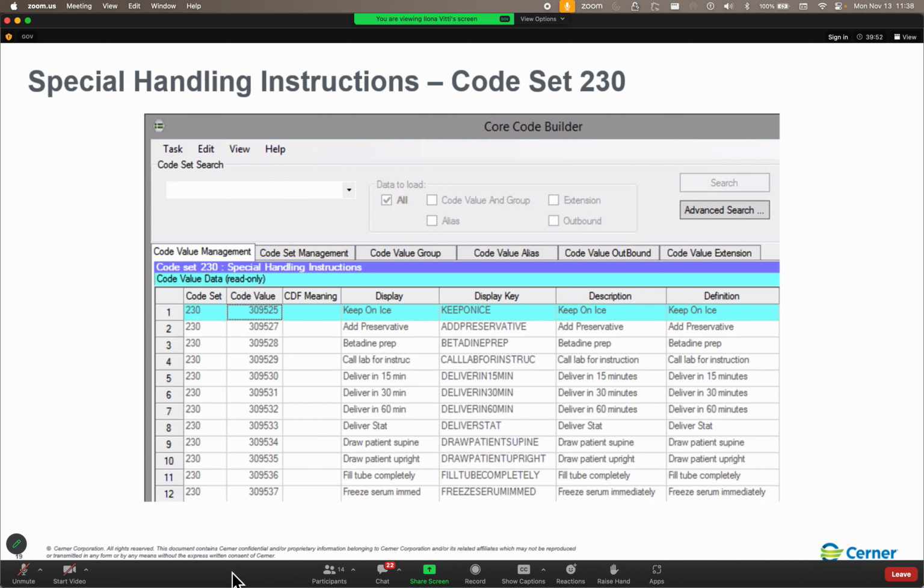Now, folks, let's talk about the limits on these different accession formats. Let's talk about the details. The Julian dated accession numbers, that bucket refreshes every day. So in my train domain, every day I can have up to 9,999 accession numbers generated, that I will be able to pull up in accession result entry.